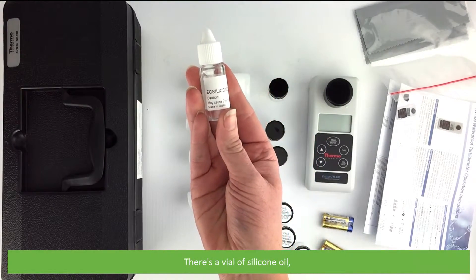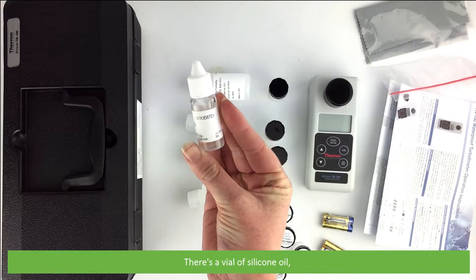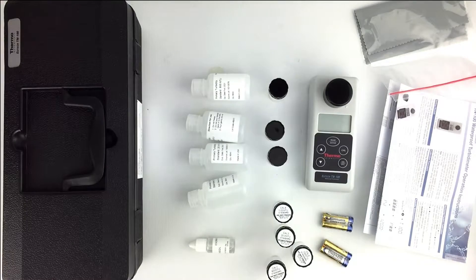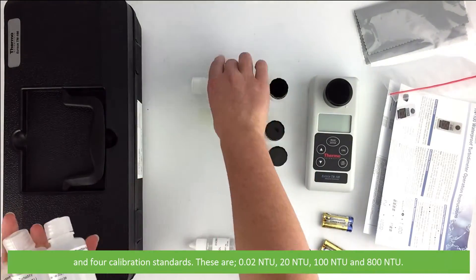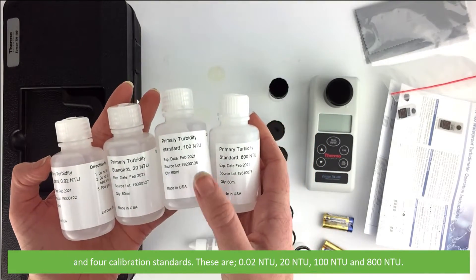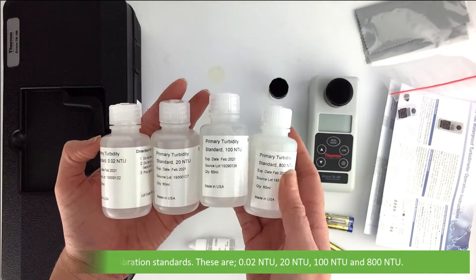There's a vial of silicon oil and four calibration standards. These are 0.02 NTU, 20 NTU, 100 NTU, and 800 NTU.